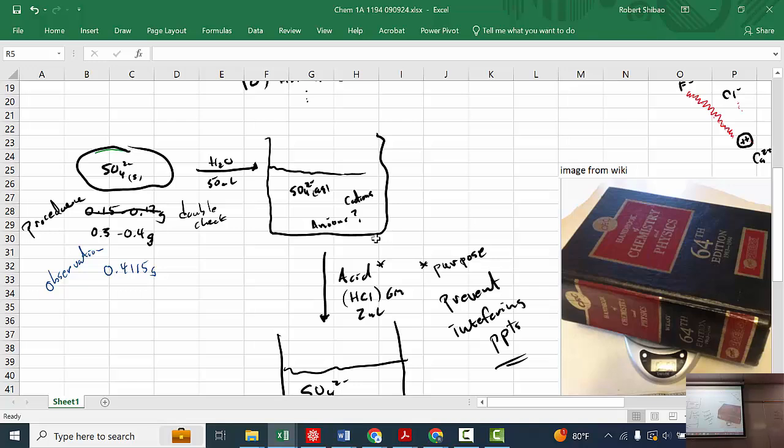Now this is ground glass joint here. But it's flat. And you see the lid doesn't fall off. The lid doesn't fall off because it's a greased ground glass joint. So if I want to remove the lid, I can't pull it off. Watch. If I try to pull it off, do you see it doesn't come off? And so what I'm going to do is I have to push it off to the side like this. Okay, and then it'll come off.